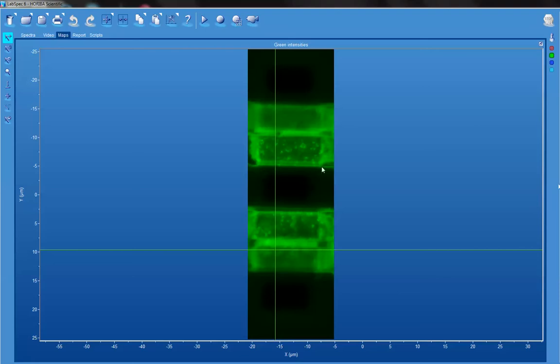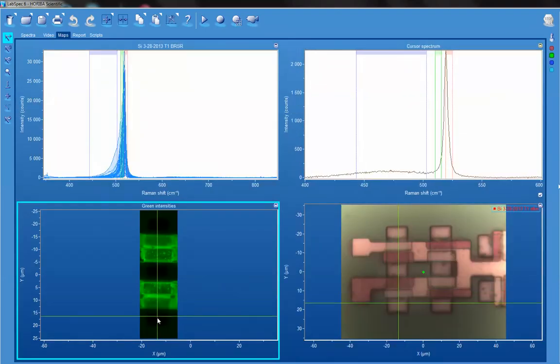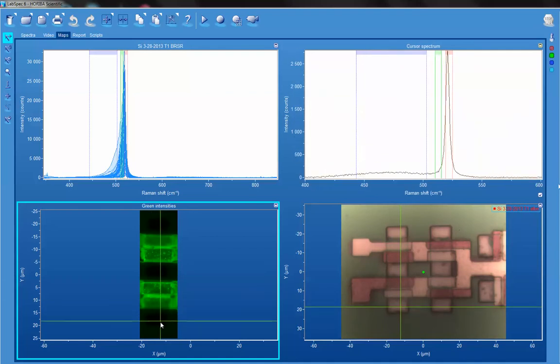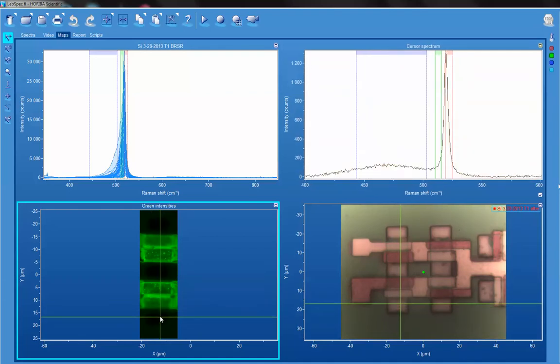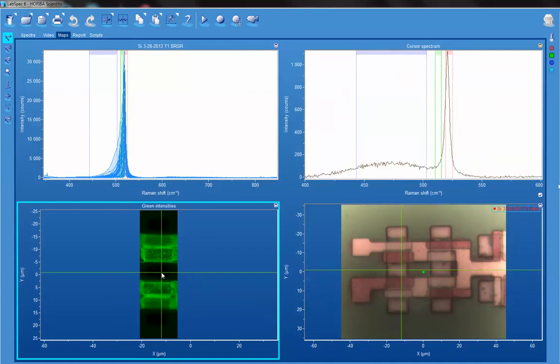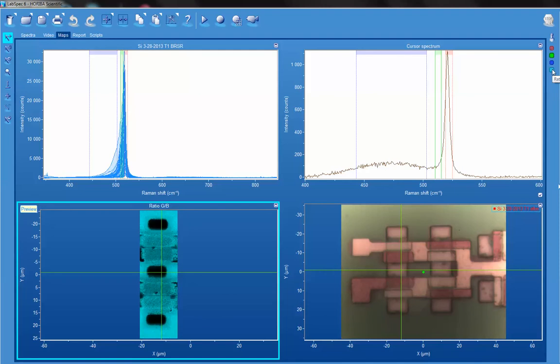Let me go back to our image. On the implants, there's substantial Raman scattering in the area of amorphous silicon. If we take a green to blue ratio, then the implants should appear fairly dark, and that's what we see.